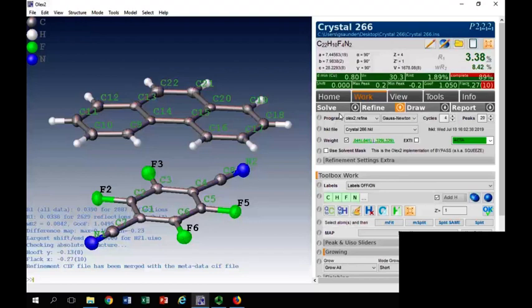Okay. So if things go horribly wrong, just start again. If it doesn't solve first time, just click on solve again. And you might start to see things. Things may not appear initially. You may have to play around and start. Eventually, things arise.